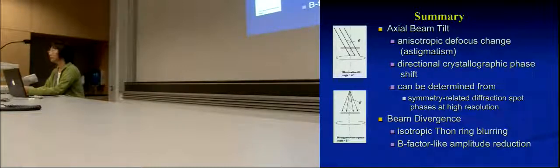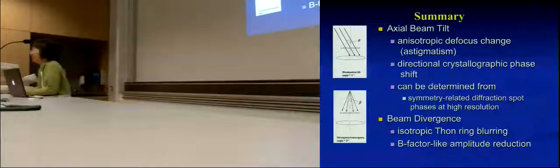Questions? Yeah. I was just wondering if Richard's original software is able to correct for every symmetry? It should be able to. Because if I just consider the example that you showed, you had this hexagonal thing, then it's clear that the three symmetry related spots would have a different effect. If I now imagine a square one, it will be able to do that as well.